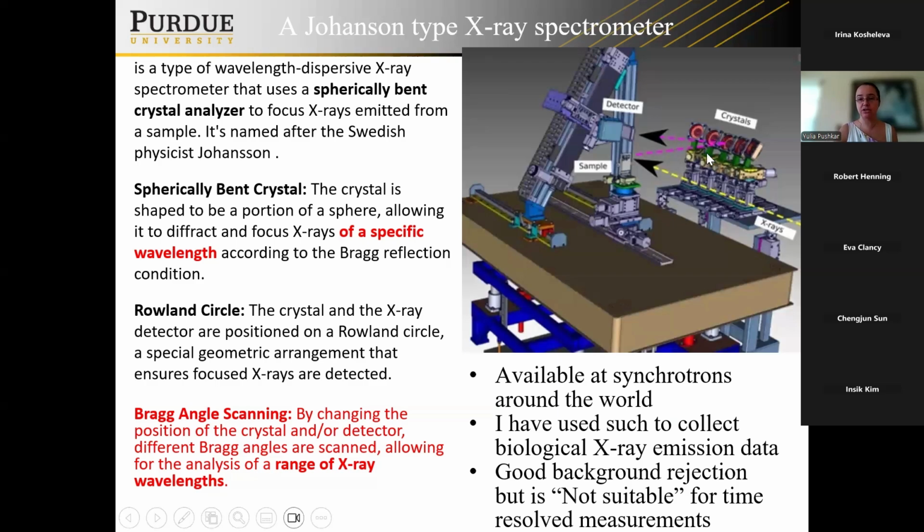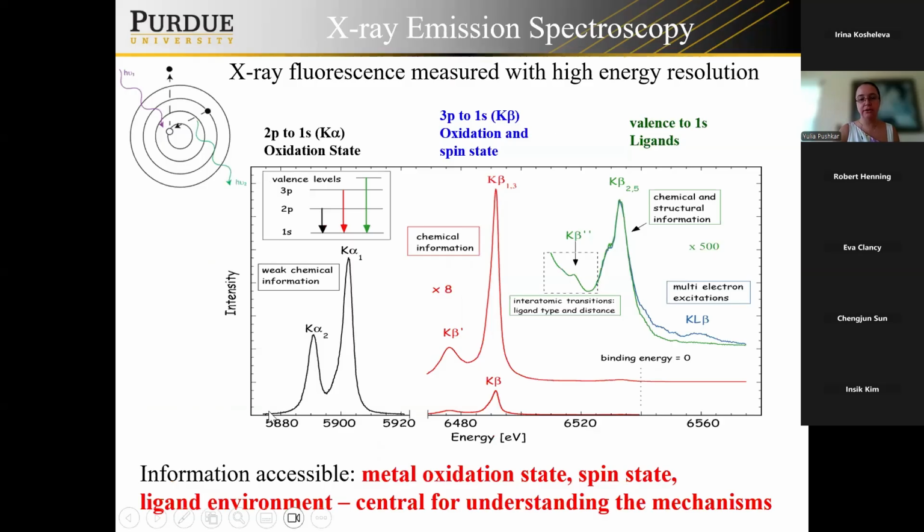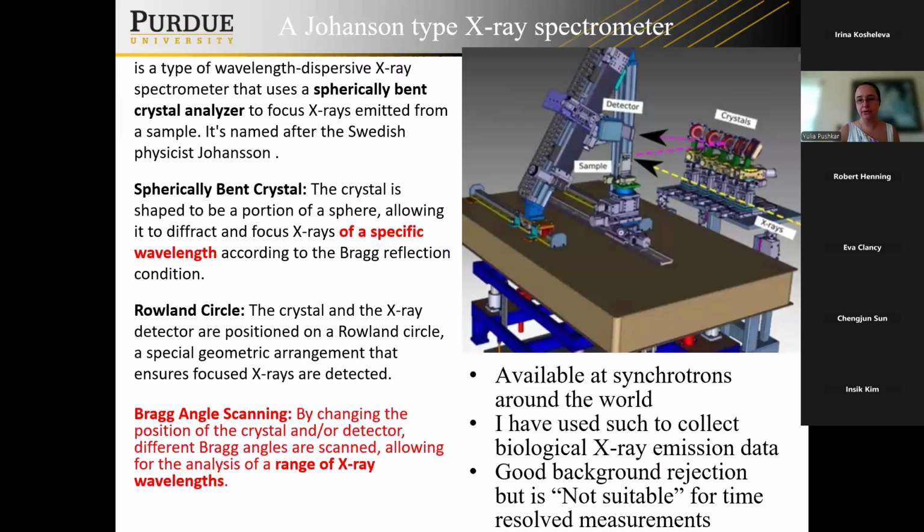So it's not just a monstrosity, it's a monstrosity that you have to continuously move if you want to scan and record. If you want to record this spectrum, and this spectrum spans 20 eV, with maybe 1 eV as your instrumental resolution in this case, you have to move this entire huge assembly with the crystals and detectors on motorized stages. And God forbid you start losing steps on your motors, then you have to start from scratch. So it's a very, very difficult technique. I worked with it myself, so I know the pain.